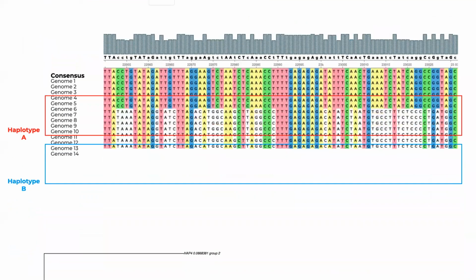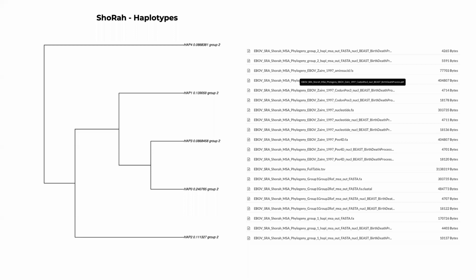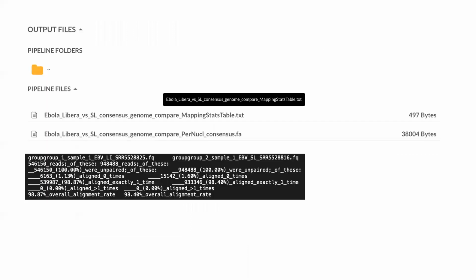For example, in the Ebola samples that we already looked at, we first of all looked at FASTA files, but when we look at FASTQ files, we'll be able to look at haplotypes and how diverse those haplotypes are compared between different groups. And when we're talking about consensus genomes, we're actually going to be looking at consensus per sample, meaning how can we generate a FASTA file if we have an SRA file with a bunch of short reads? How do we actually get that full sequence?